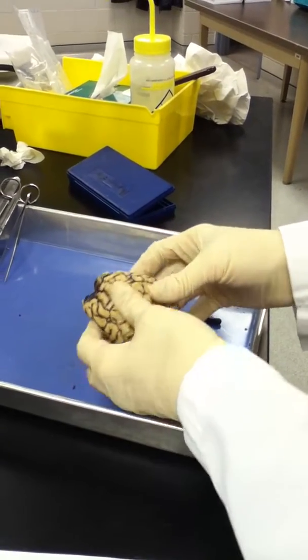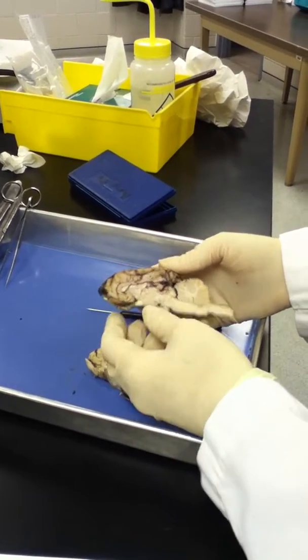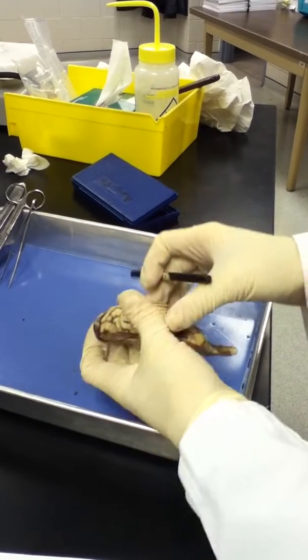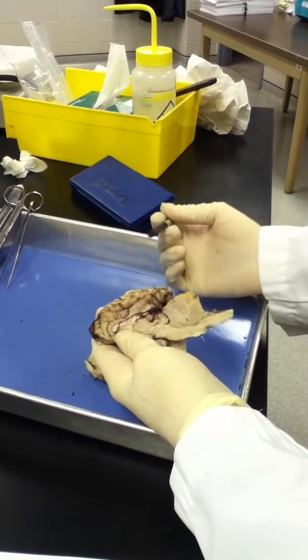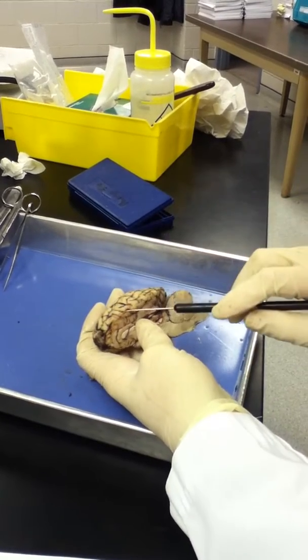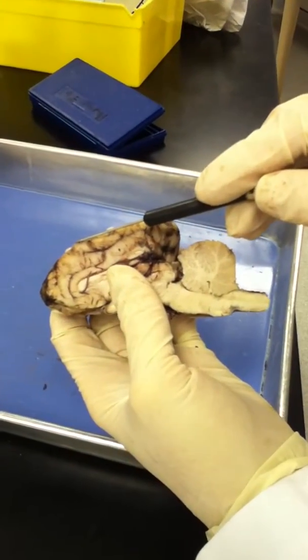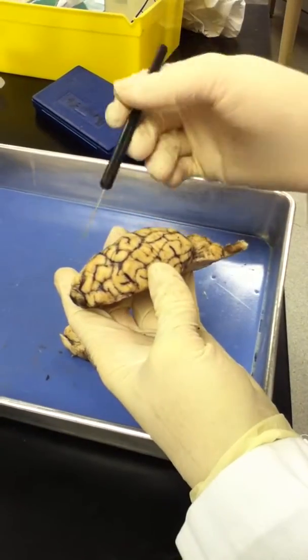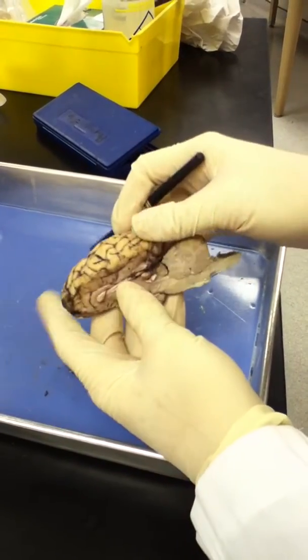We did a longitudinal cut right down the fissure to separate the two hemispheres. This is the right hemisphere, and this is the internal medial view. The dura mater has been removed. There is remaining arachnoid mater, which I've hooked here. The pia mater is also right under that, and the black that you see is the vein and vessels that feed the brain.